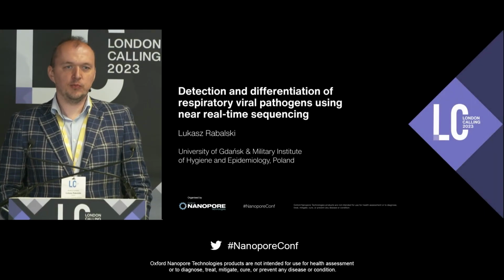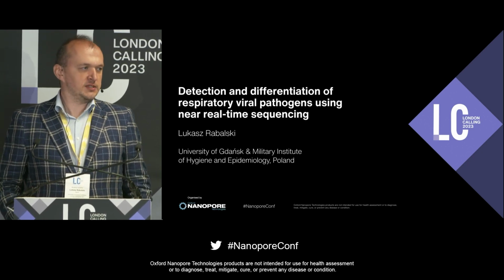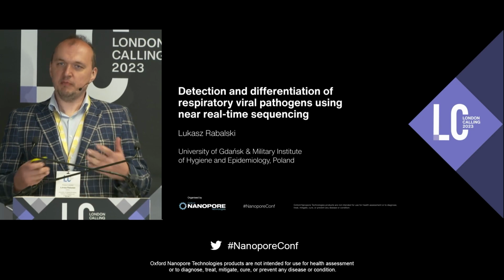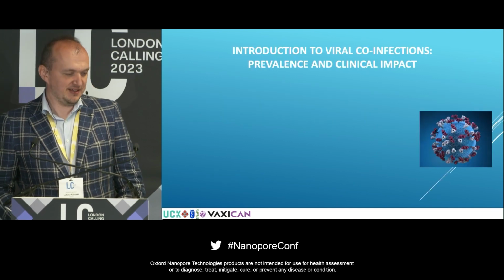And what about the nanopore? The nanopore is about sequencing anything, anywhere, by anybody. It's easy, yes? Now sequencing is easy because of the nanopore, but I will show you the pain that can still exist somewhere there.